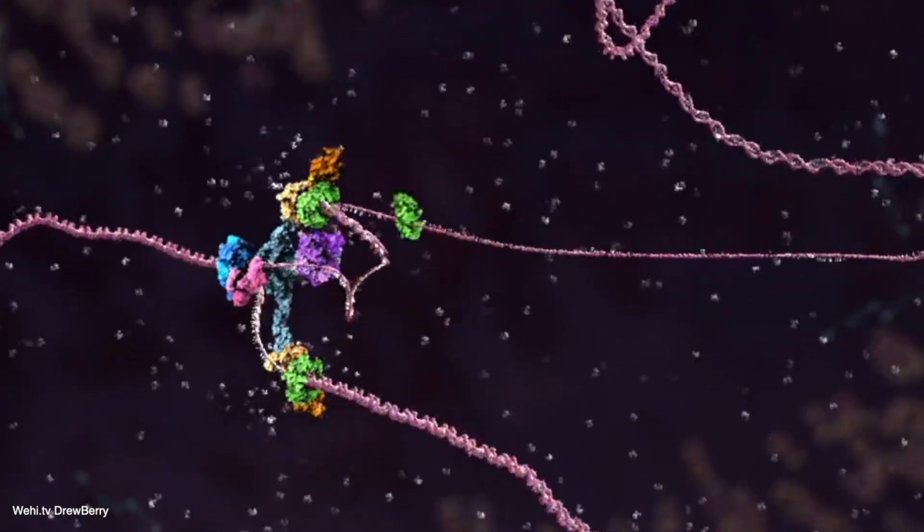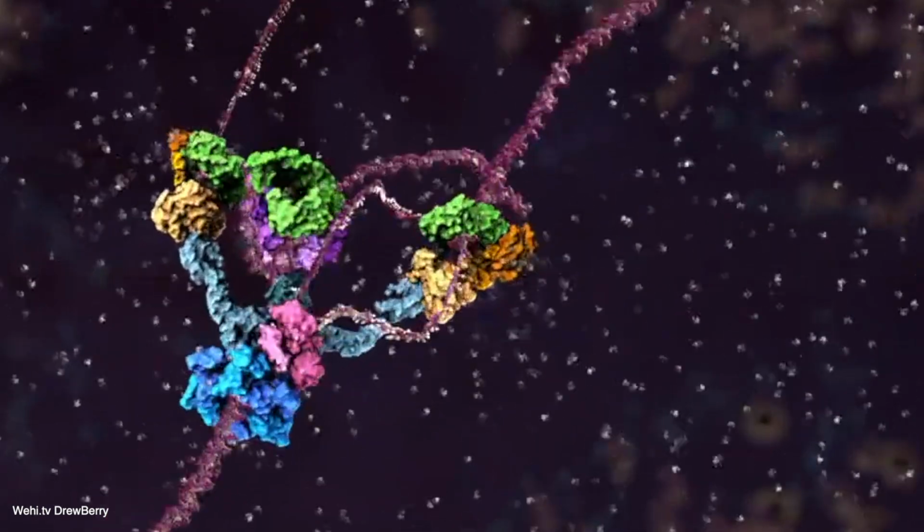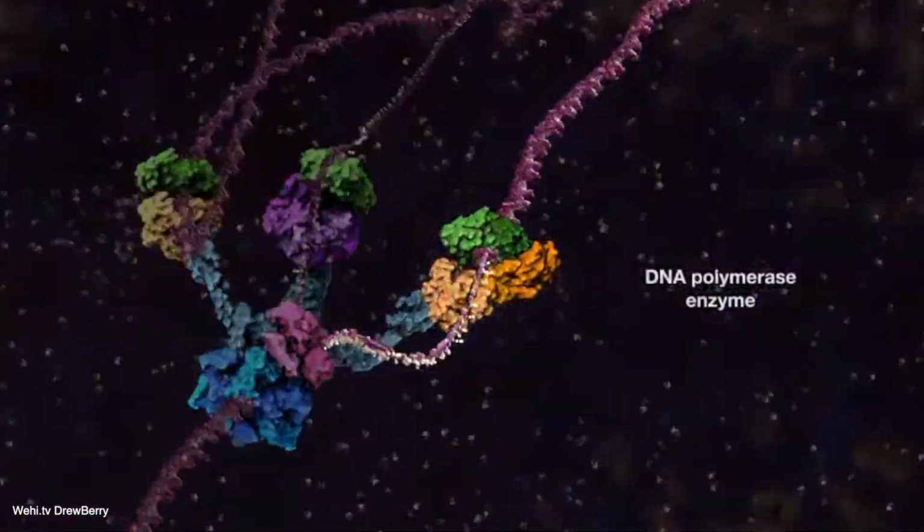Looking at the underlying mechanism of LAMP, we might first of all ask, how does nucleic acid amplification at a constant temperature actually work? It works because in LAMP we make use of a polymerase that has an inherent strand displacement capability. What does that mean? It means that the enzyme that is performing the amplification reaction can open double-stranded DNA by itself and does not rely on heat alone, like in PCR, for denaturation of the double strand and annealing of primers. So at the heart of every LAMP reaction is a polymerase with a strand displacement activity, which is a crucial difference to PCR-based methods.